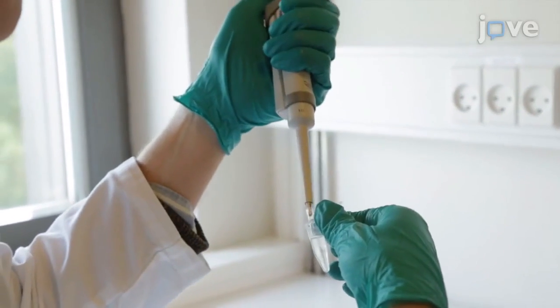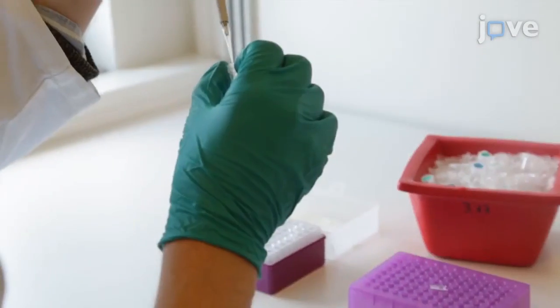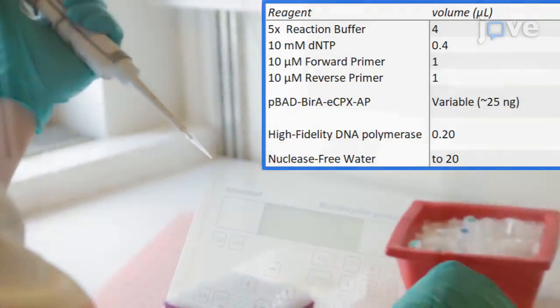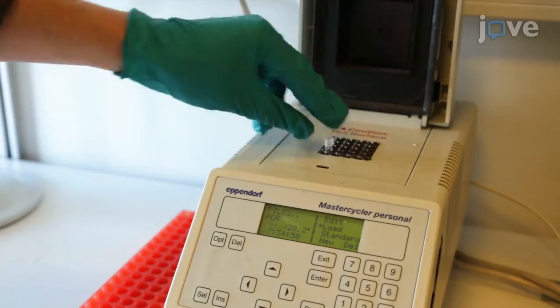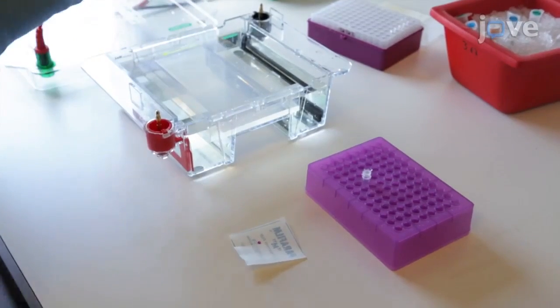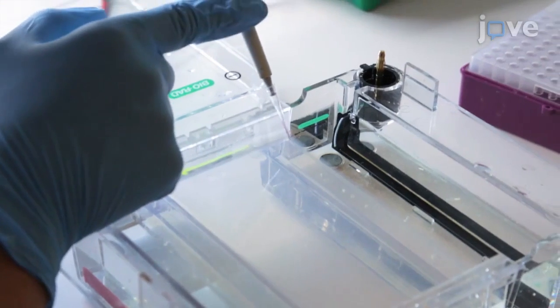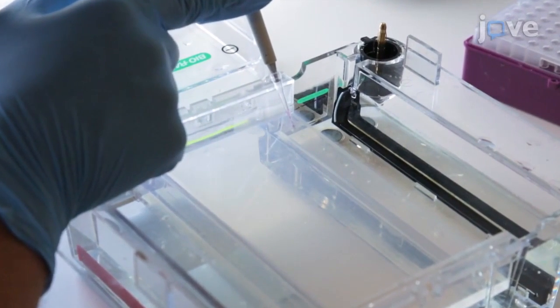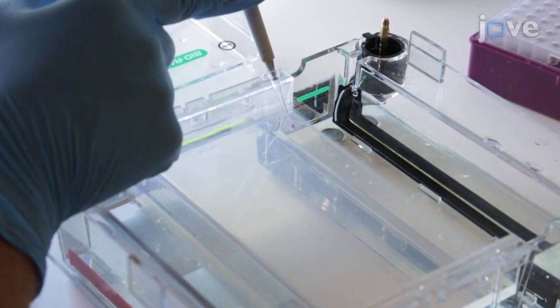Then, to set up a 20 microliter PCR reaction, add the reagents in a thin-walled PCR tube. Transfer the tube to a thermocycler and perform PCR according to the manuscript. Next, run 5 microliters of the PCR reaction on a 1% agarose gel to confirm the amplification of a 6 kilobase PCR product and proceed according to the manuscript.